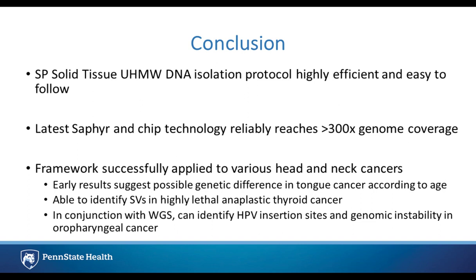So for the tongue and thyroid patients, I did not do any sequencing. But for those, I did use the rare variant pipeline, which I think you're alluding to. That pipeline is able to detect variants that can happen at low frequency, say 5%, but it's not limited to only detecting rare structural variants. For each of those tumors, I was able to generate a genome for each one, and then compare that to the reference to determine different structural variants.